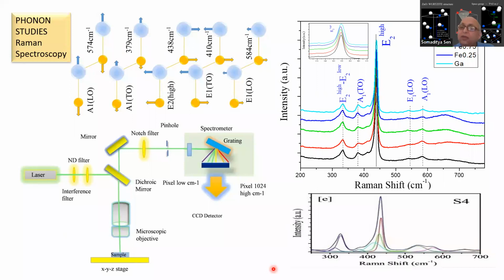But that fitting has to be very qualified fitting, because if you do not expect a frequency at that point, then it becomes problematic for you to understand what it is. So suppose you are doing a forensic test, you must be expecting some components in that test. Suppose you see the victim has got some traces of something.